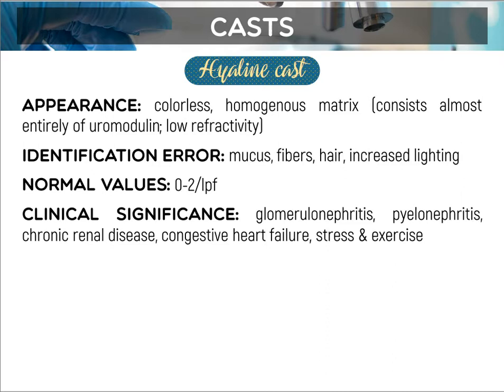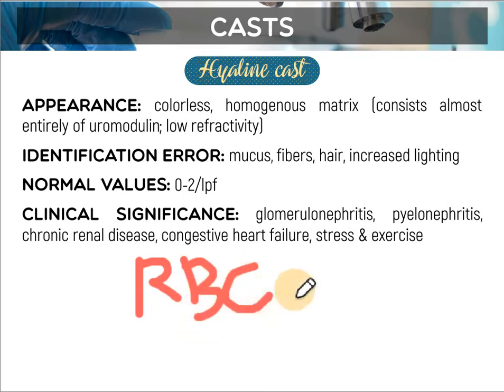Okay, back to hyaline cast. As you can see here, stress and exercise. One thing to take note of, guys: whenever there is stress and exercise, these casts are present. We have your hyaline cast, your RBC cast, and your granular cast.